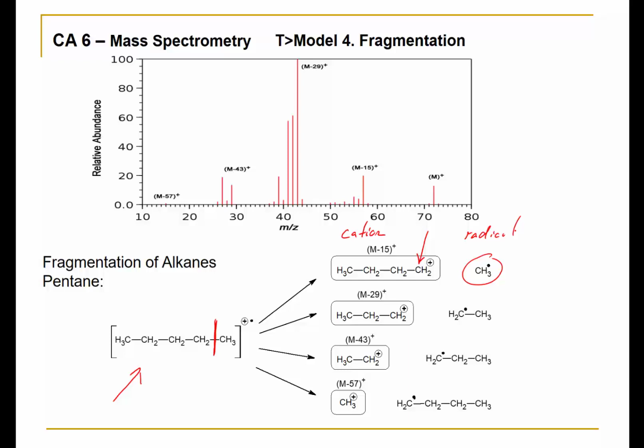You'll see in the mass spectrum that often we don't even bother to indicate what the actual m/z value is, but rather we're indicating what got lost. Furthermore, often in a mass spectrum, these sorts of M- values aren't actually given, but rather you'll need to calculate them. And so being able to calculate them will help you figure out, well, what fragment does this correspond to?